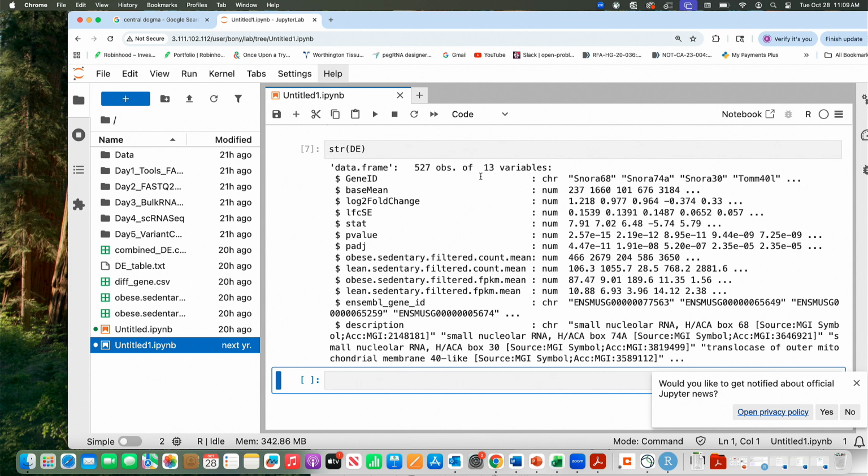Yeah, the last of the file. So you also want to know whether all the files were copied or not, because some truncation may have happened. The moment you get a file, you should not start doing everything with it. Just check: this is what you are expecting from your file, and is everything there? Okay, so is everybody with me at this point?